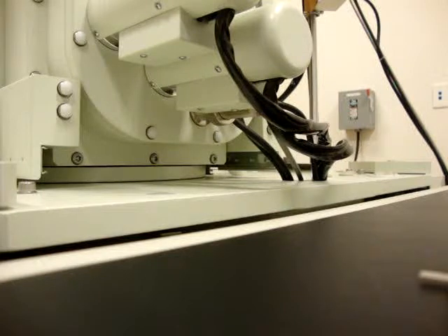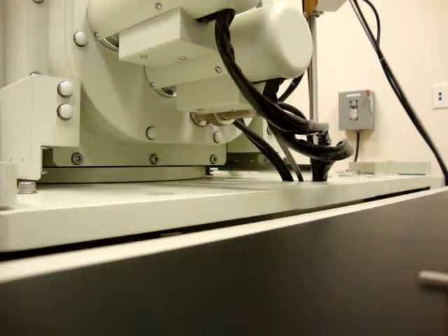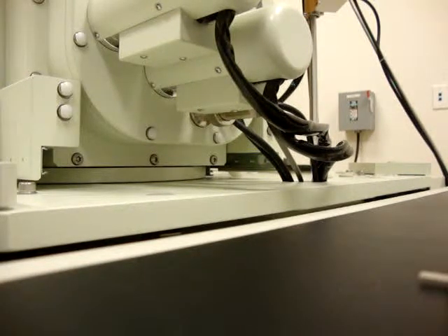What is this export black and white, color, normal, extended when you're saving? I bet when you have the EDS, you can colorize things. Yes, the EDS comes back in color, and you can export it in black and white. Now, what are these, full image, specimen? Full image means the whole thing's a picture.